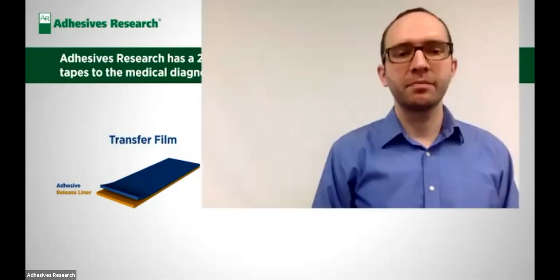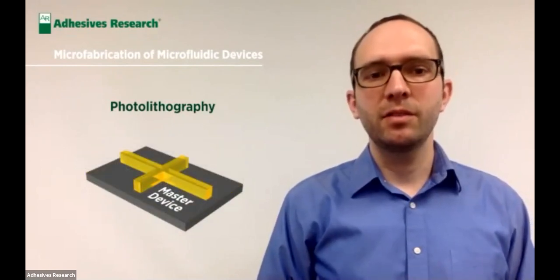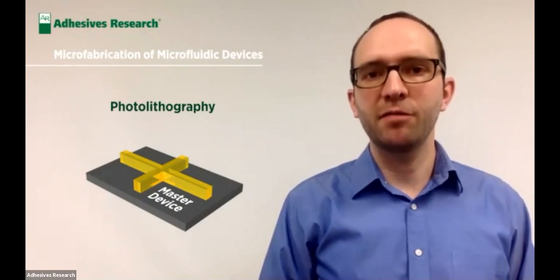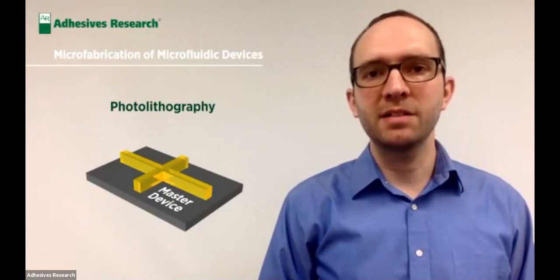Microfluidic devices are commonly prepared through a process known as soft lithography. It begins with the traditional photolithography approach, in which you take a silicon wafer, spin coat SU8 or another type of epoxy material onto it, and then through a lithographic mask and UV light, you form your master device. This type of master device can then be replicated numerous times in the soft lithography process. And that involves essentially casting PDMS onto the surface of the master mold, curing it, and then removing it from the surface.